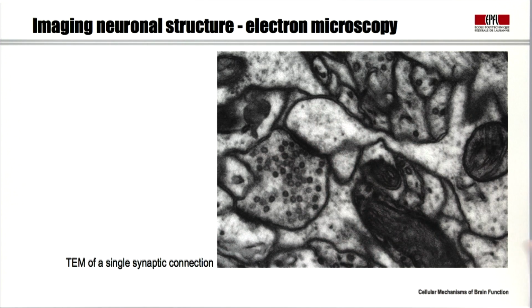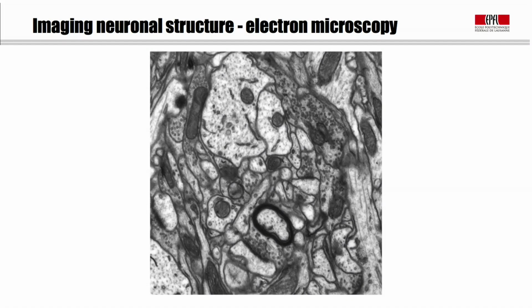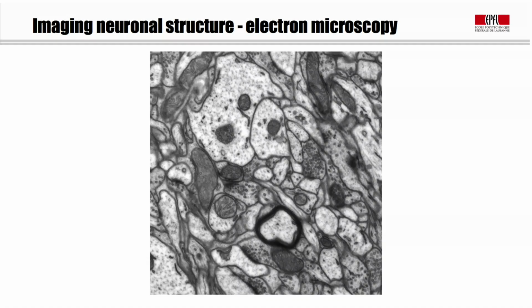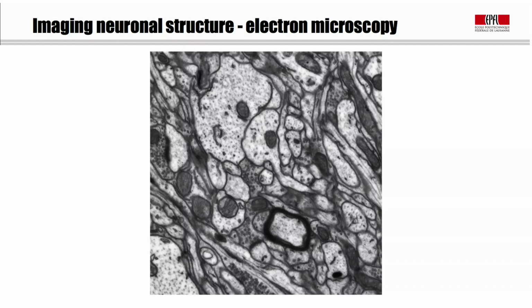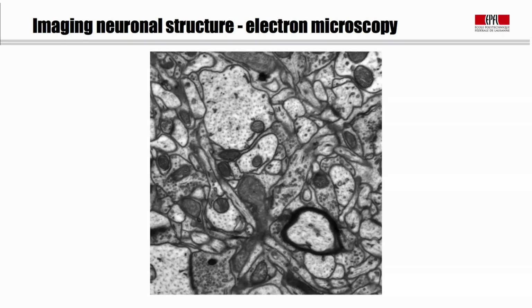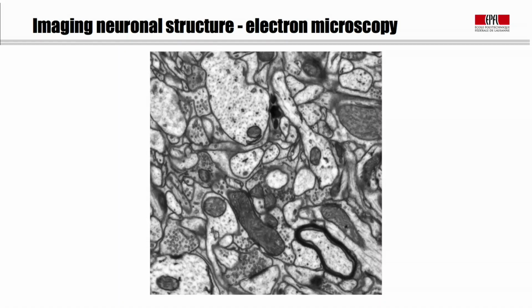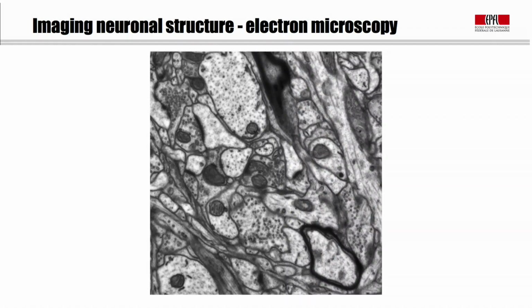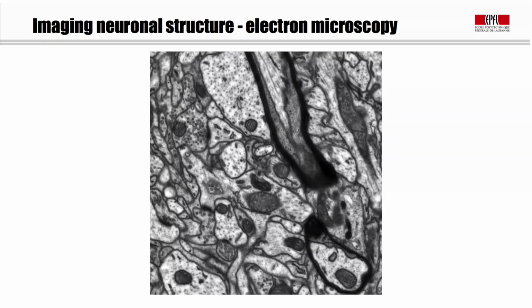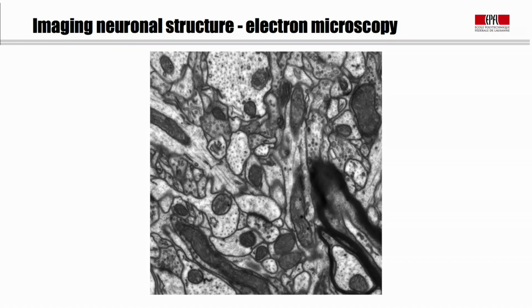And we can get a lot of information from just this two-dimensional image. Of course, what we could do is get serial images from the electron microscope and gather lots more information from this type of material. And here we have a series of images through a piece of mouse cerebral cortex. And we can start to appreciate the three-dimensionality of the features that we're looking at. In these serial images, which are 50 nanometers apart because they're 50 nanometer thick sections, we get an appreciation of this very complex architecture in the brain.